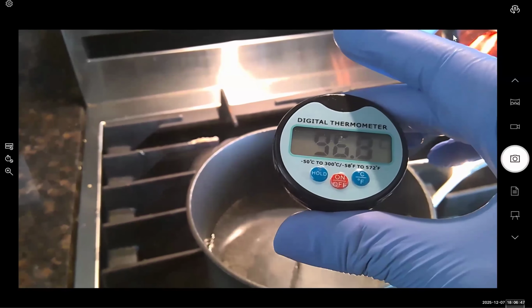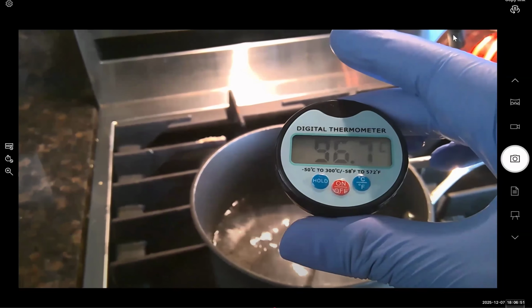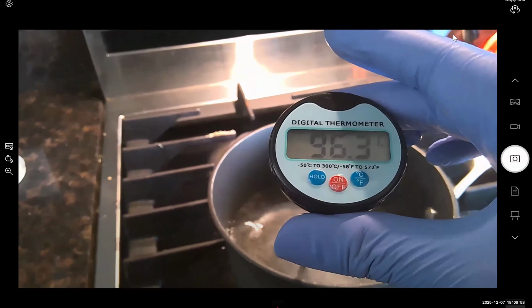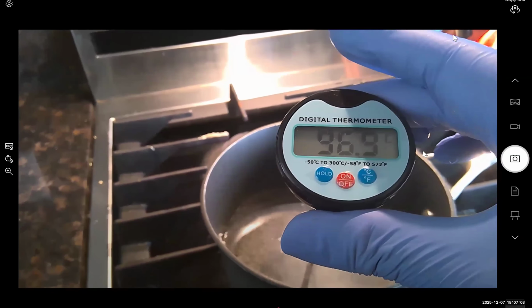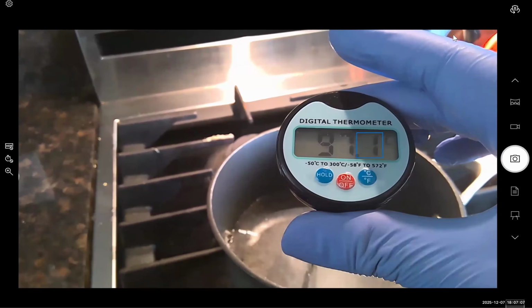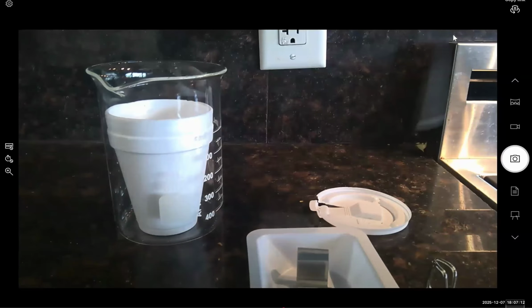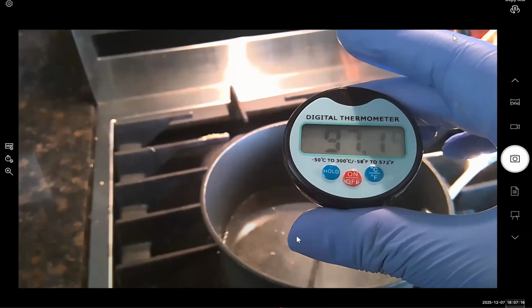Okay, it looks like it's leveled out at 96.8 degrees Celsius. Okay, it's finally settled down. Give it a few moments. Let's go back. So it finally settled at 97.1 degrees Celsius.